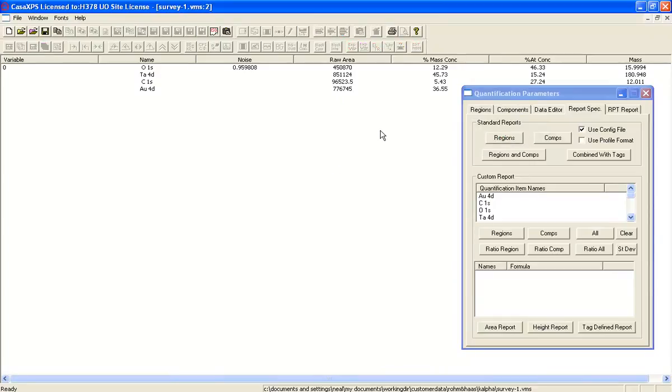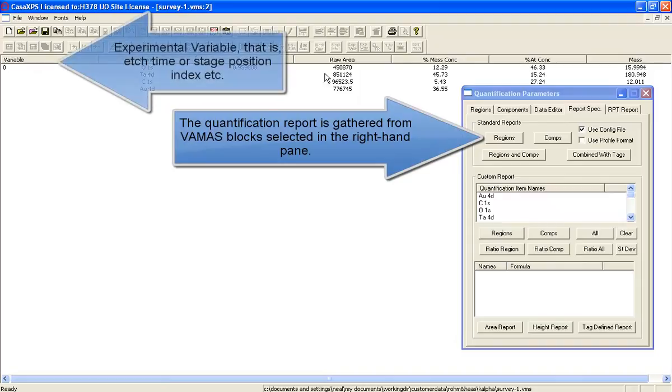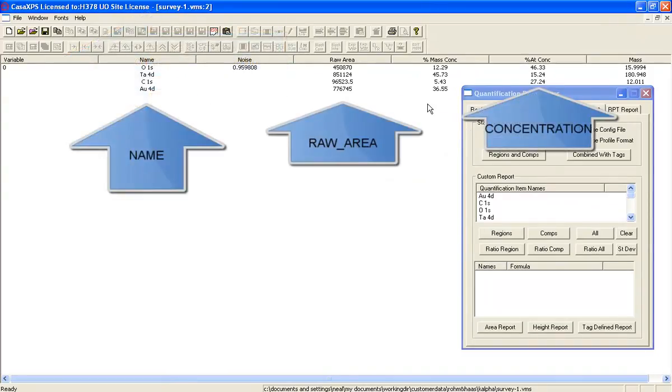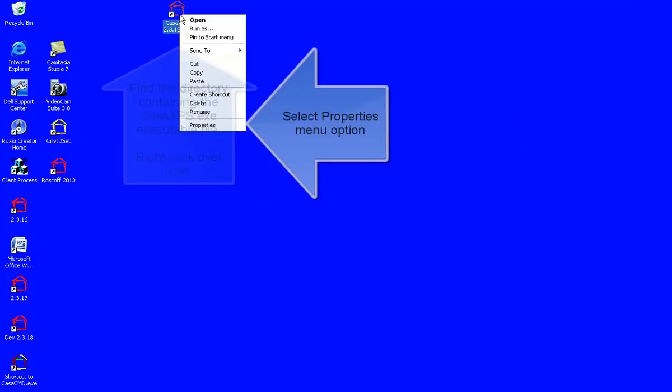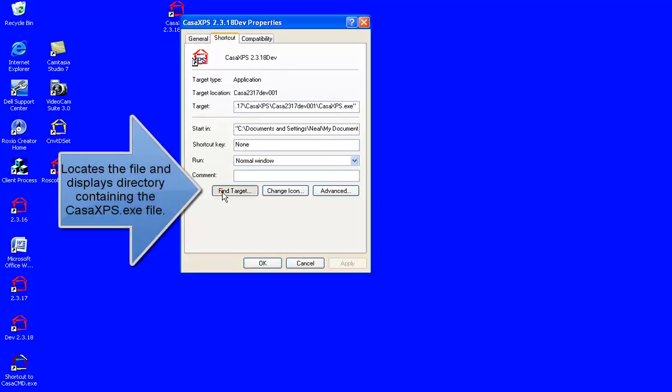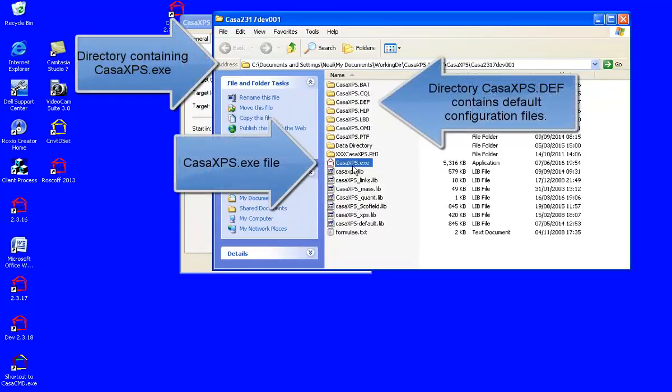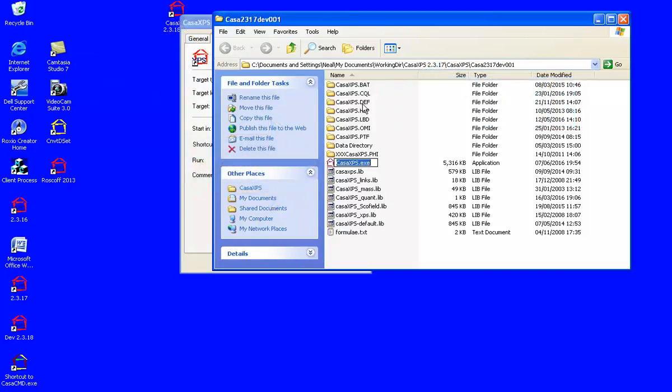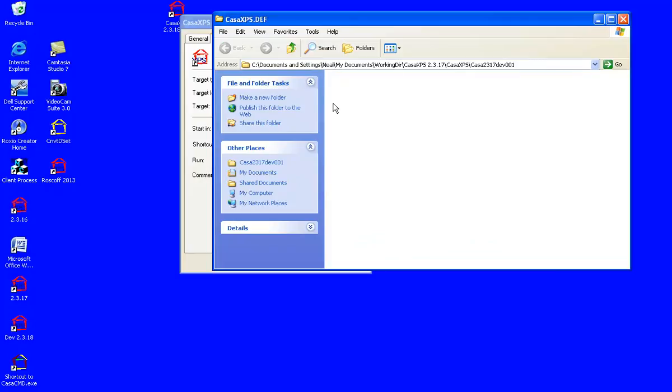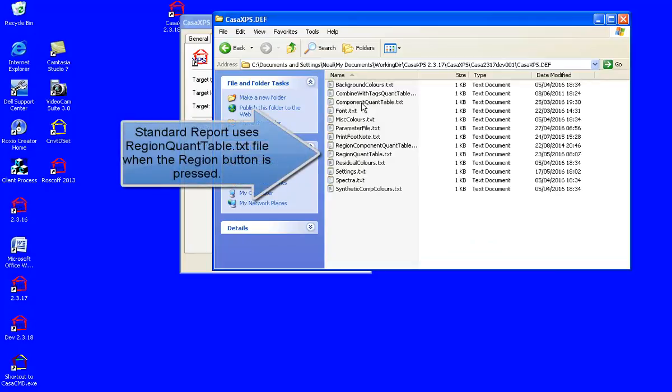Selecting the regions button in the standard report generates a set of entries which are determined by a configuration file that is located in the same directory as the CASAXPS executable. In that directory there's the executable and a CASAXPS.DEF directory that contains a set of configuration files.